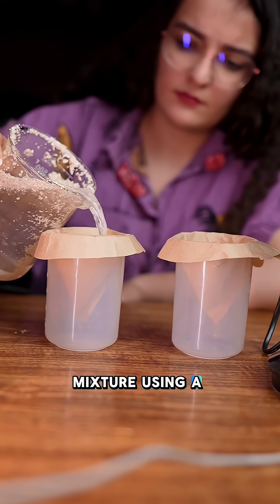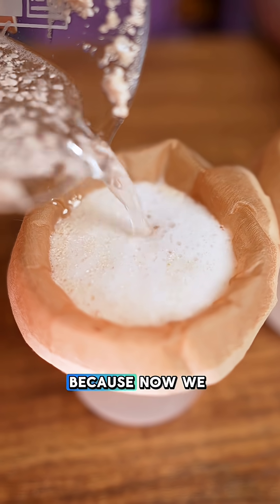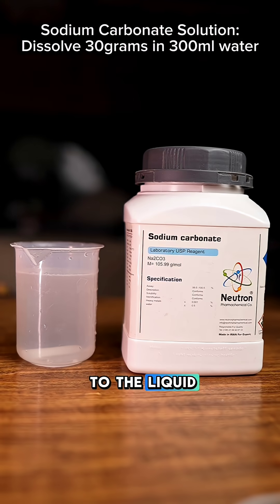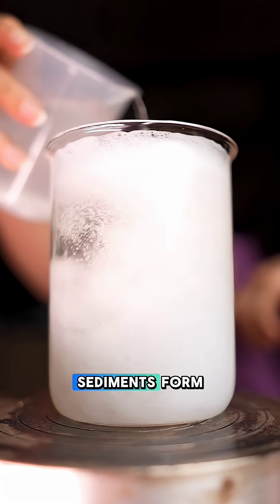I filtered the mixture using a coffee filter to remove the residues, because now we need the liquid. Next, add your prepared sodium carbonate solution to the liquid, and watch as the calcium carbonate sediments form.